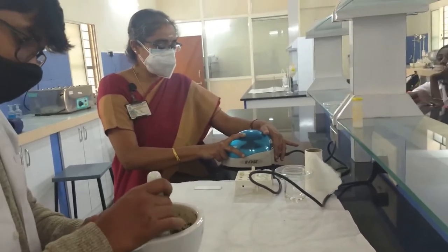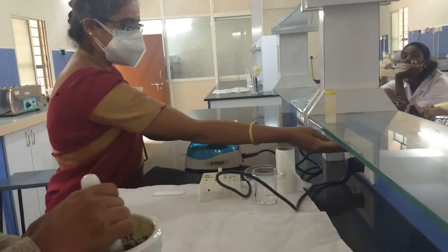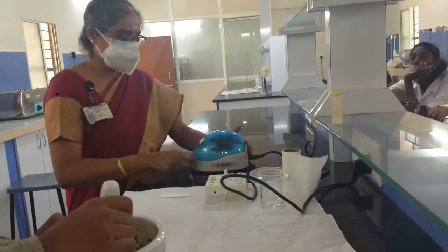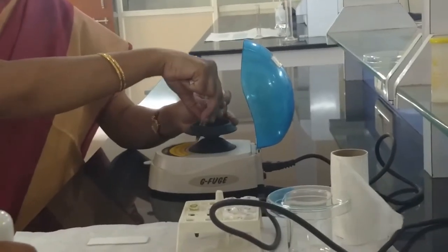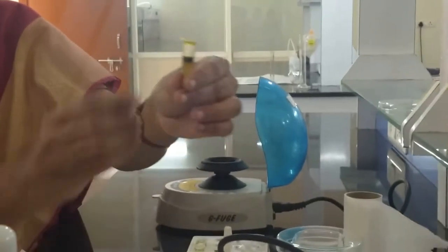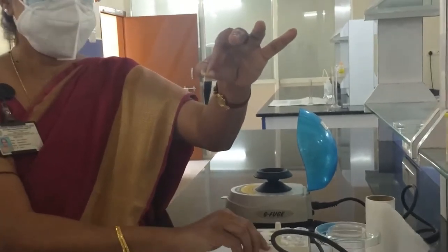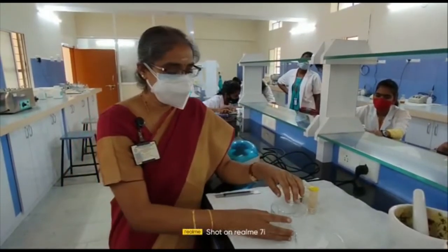After spinning for 5–10 minutes, switch it off. You can then see a clear supernatant layer — the organic layer containing the plant pigments as a dark green color. This extract is the sample with which we are going to perform the chromatography. The mobile phase now has to be taken in a chamber.